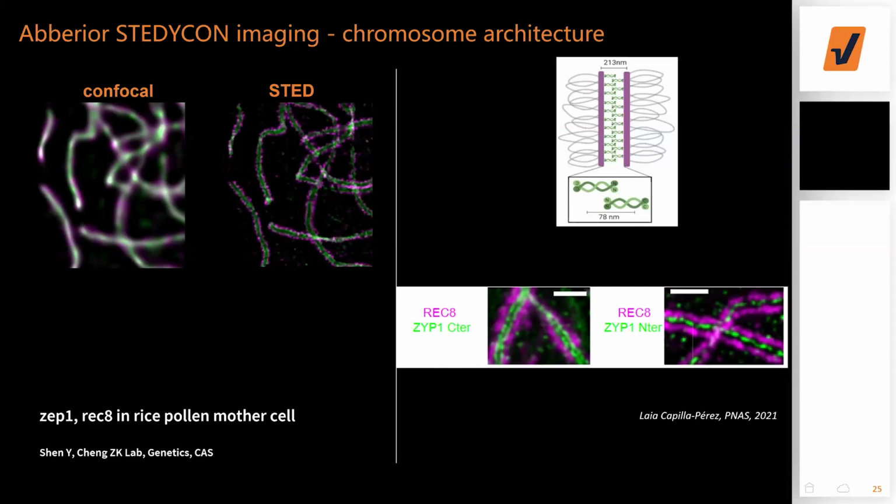So here's another example that shows exactly this concept. What the customer would like to see is the chromosome architecture during the duplication. There are 2 chromosomes, right? They're separated and the chromatin is duplicated. So now you see here, if we stain the scaffold protein, REC8, now you see 2 lines, they're outside.